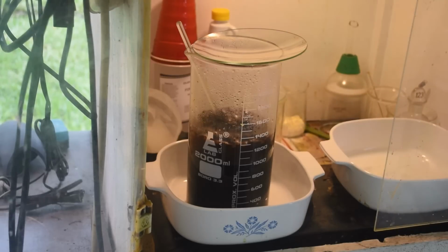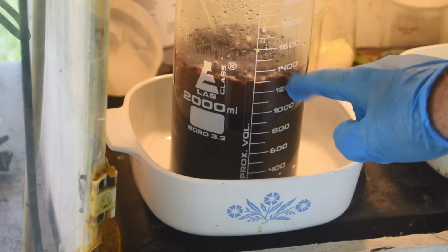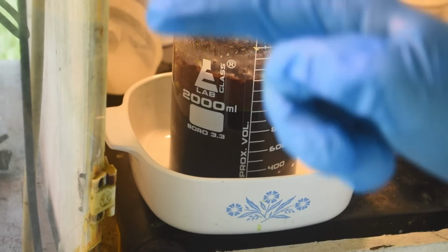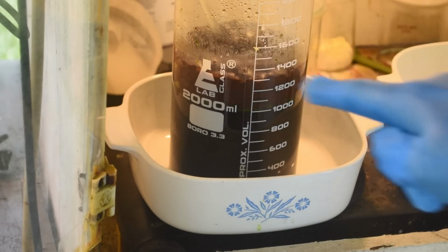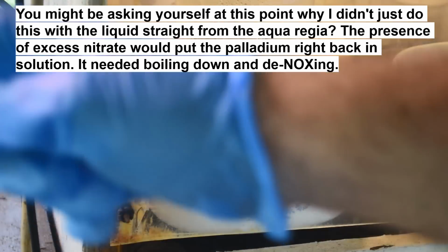I'm talking like milligrams at the most, I'm sure. Maybe a gram. So, all that red stuff right there, I hope it's showing up between the top of the liquid in here. That's all palladium ammonium chloride. So once I've done filtering all that other liquid over there, I can clean up the filter funnel, put a new filter in it, and we can filter this stuff off of this liquid here and get our palladium. That worked a treat. I'm happy with that. Okay. So I'm going to let that sit and cool down a little bit. I've still got more filtration to do over here anyway.